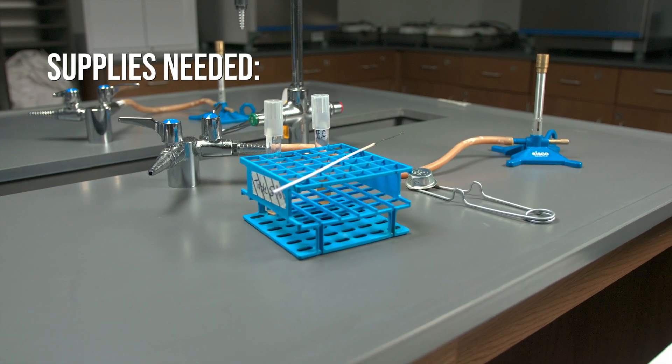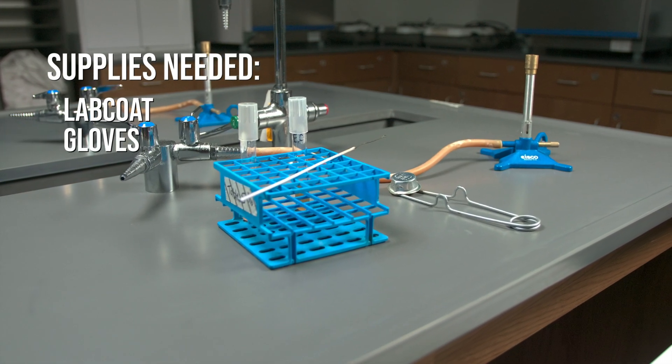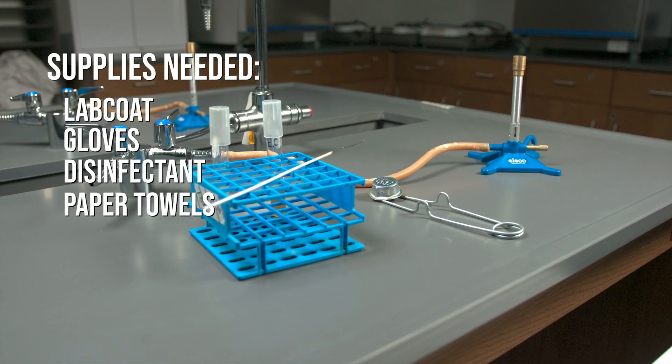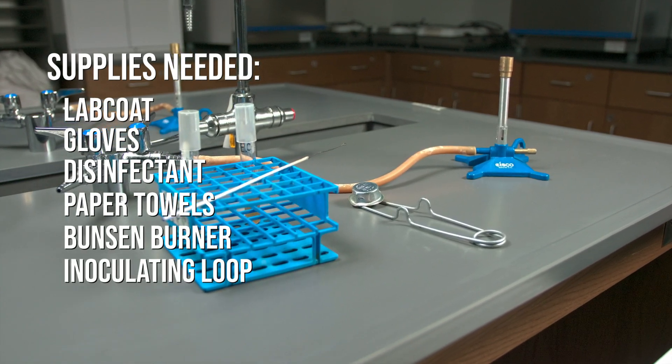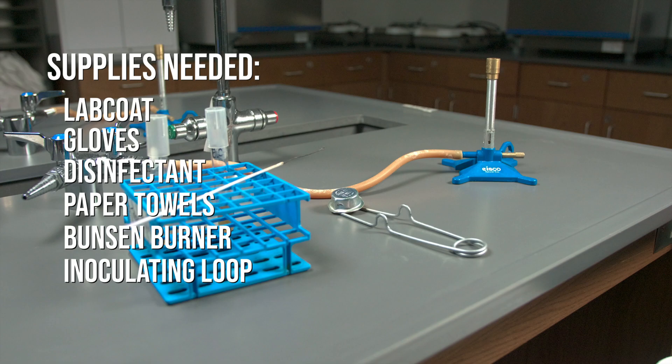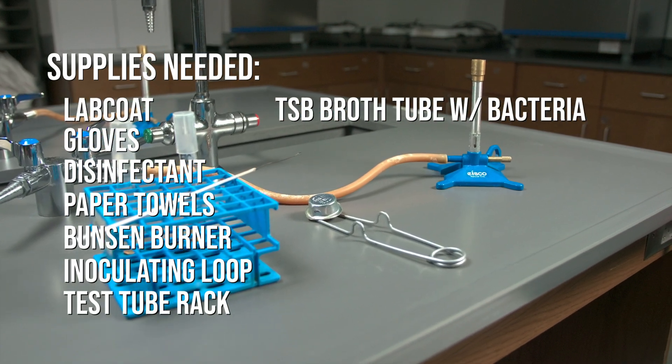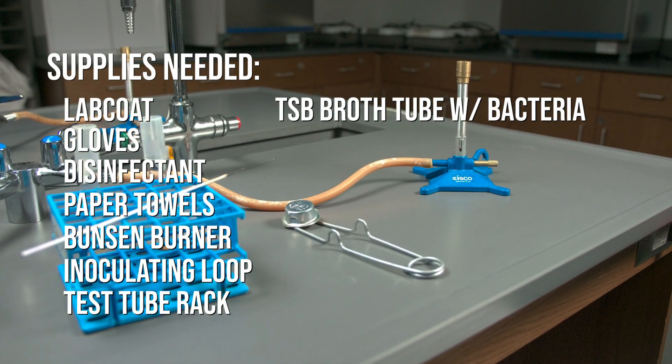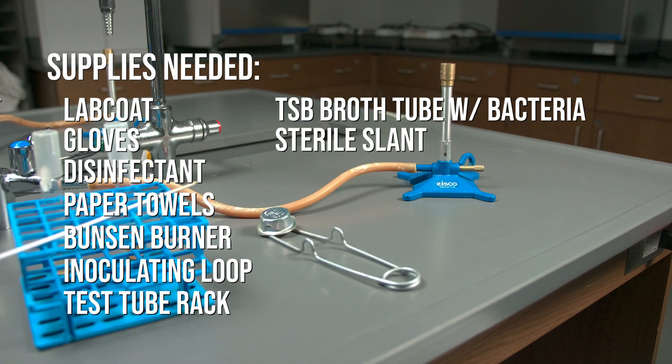The supplies you will need are a lab coat, gloves, disinfectant, paper towels, a Bunsen burner, an inoculating loop, a test tube rack, TSB broth tube with bacteria, and a sterile slant.